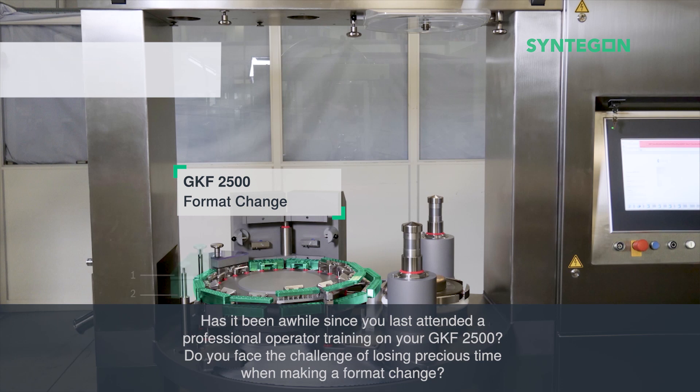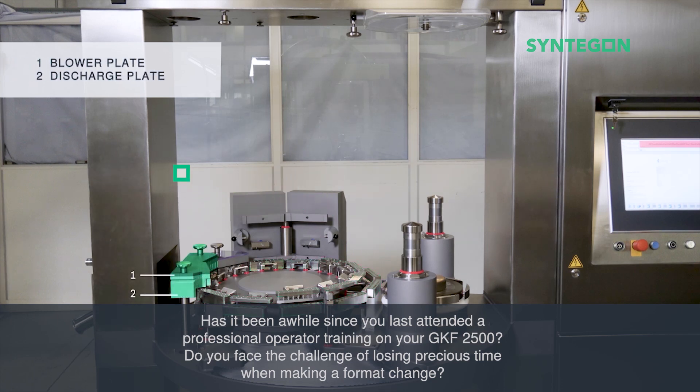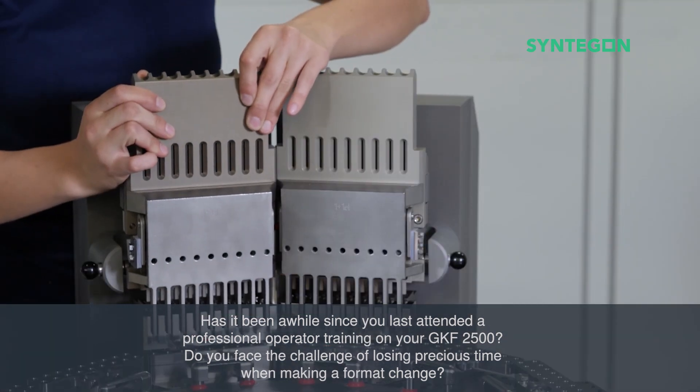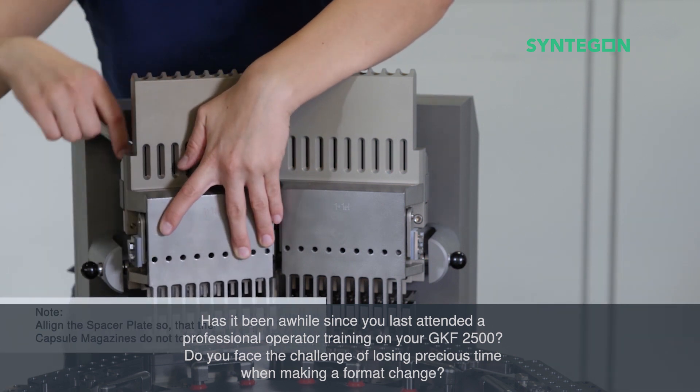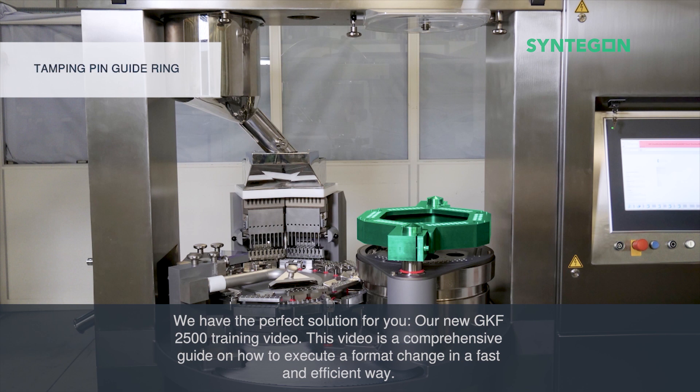Has it been a while since you last attended a professional operator training on your GKF2500? Do you face the challenge of losing precious time when making a format change? We have the perfect solution for you.